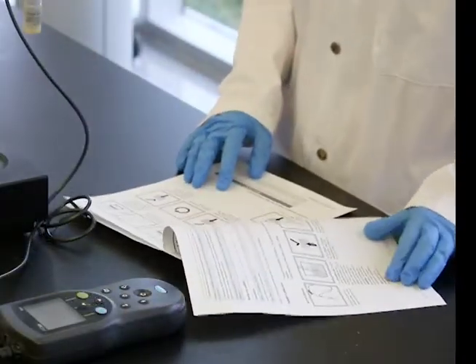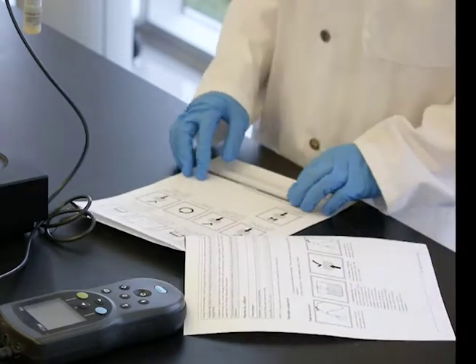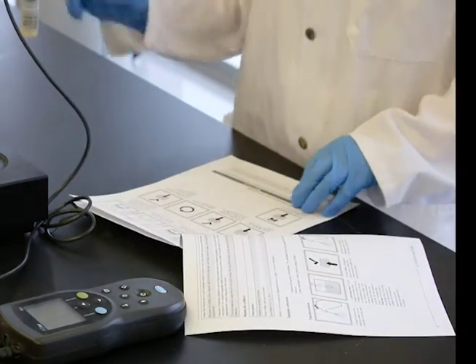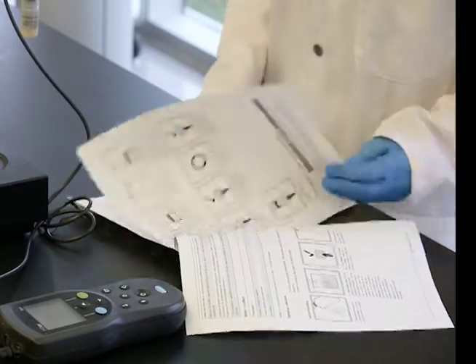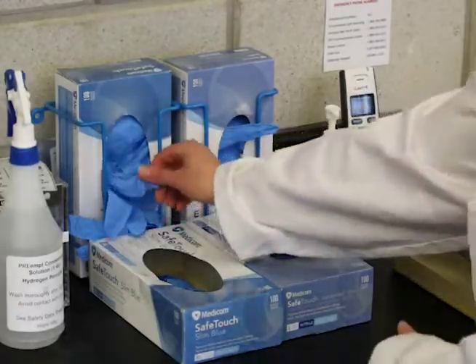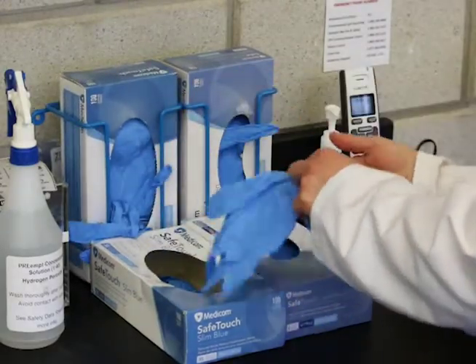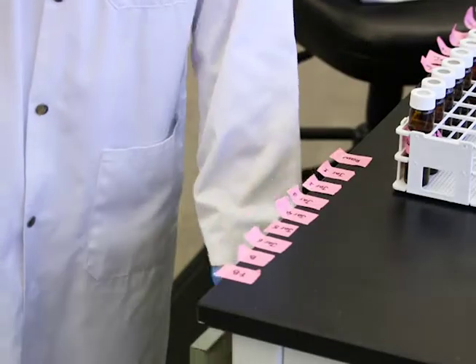This is a basic procedure overview. You should always refer to the methods provided by the probe manufacturer for preparation, measurement, maintenance, and storage information. It is important to review the safety data sheets for the chemicals that are used and to use the recommended personal protective equipment.